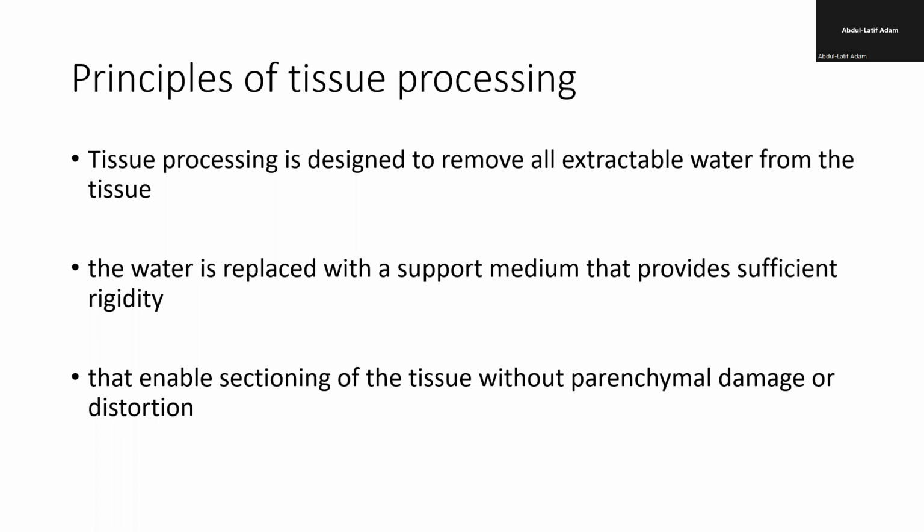So tissue processing is aimed to preserve the tissue in a condition where further studies can be done on it, apart from the normal H&E. But in order to keep anything well, you make sure that there is no water in it.